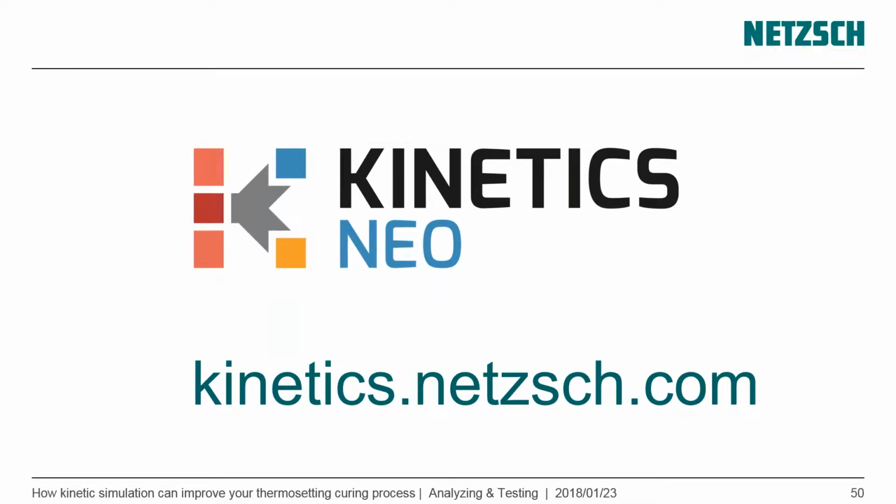The next question: in case of the aging, I'm interested in how it is possible to see the material changes. We have a DSC polymer machine. I think the question is split. No, it's the whole question. Okay, it's aging. You can model aging with Kinetics NEO as well.